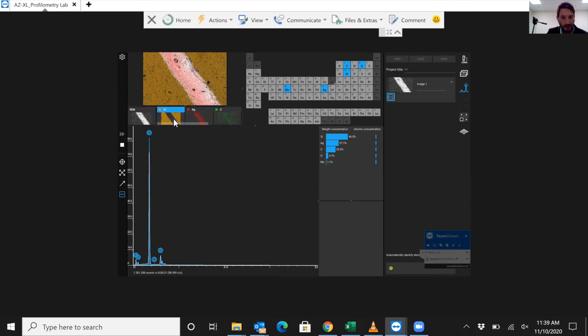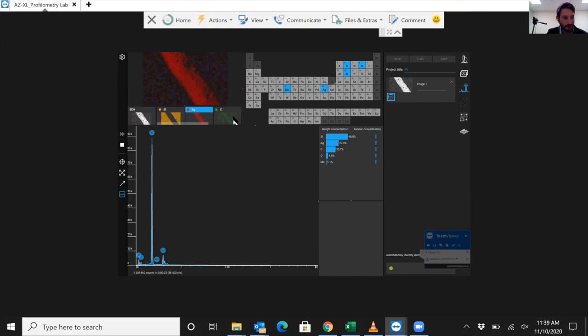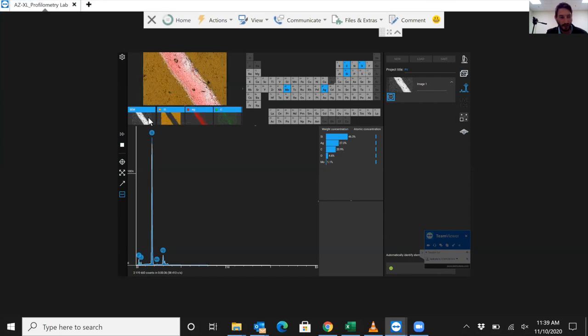So you can see here, we have silicon, we have silver, we have carbon. This is what EDS mapping does. Each pixel in the image, the brighter the color of the pixel, the higher the concentration of the material at that pixel. So that's EDS mapping. Really, really useful, really cool. And then I can press Control A and overlay this so you have everything at once. You can change the colors of these things, and so on and so forth. So that, in a nutshell, is the Phenom.